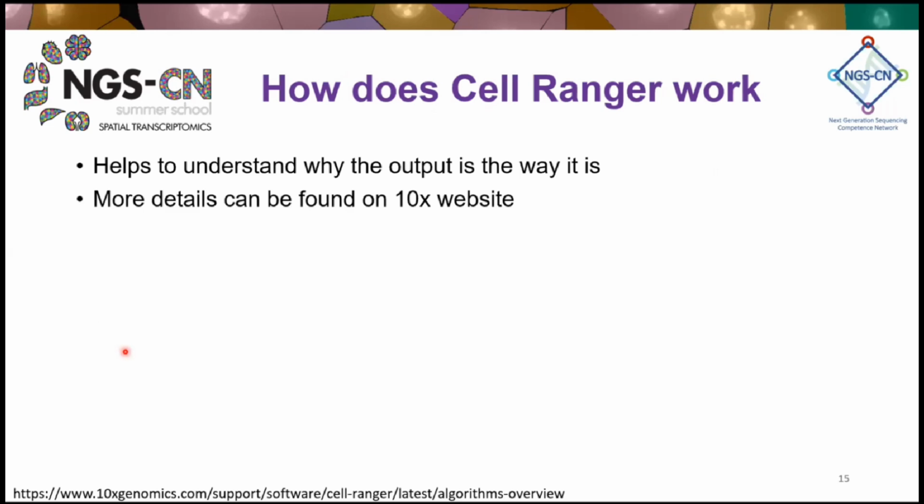So how does Cell Ranger work? And in the next slides, I will show you some of the details. I think that it is important to understand this because typically, let's say, for example, you start with counts, okay? Then, yeah. And if you understand the details, you understand the output. That's what I said.